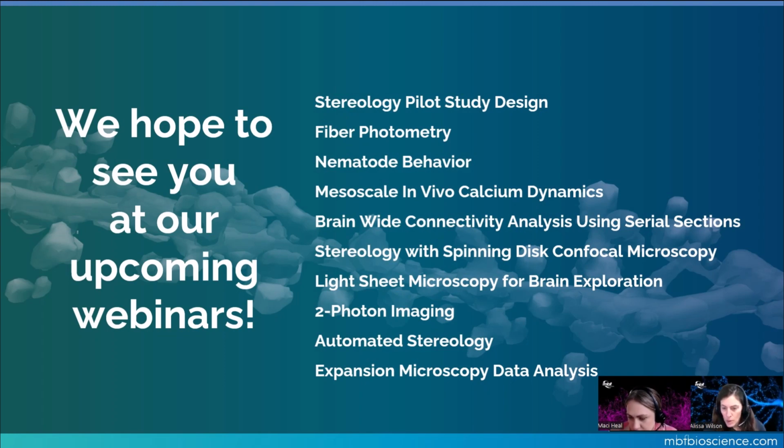All right. Oh, and then, okay, so we also had another question. Does this approach also work for a series of slide scanned images, TIFF image specifically? And yes, you can open the series as a stack to do the reconstruction. This will work the best if you have a smaller Z-step, but again, depending on what you want to reconstruct.